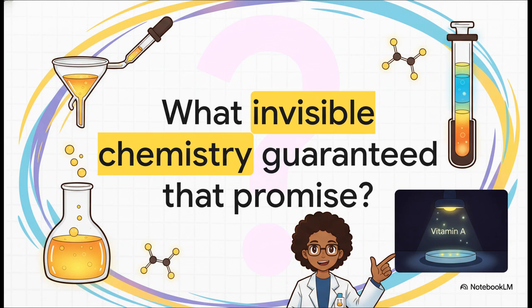Thanks for joining me, Dr. Chem, for this explainer. We've seen how saponification, selective extraction, and precise chromatography all work together to guarantee product safety. So, the next time you pick up a fortified food product or a container of infant formula, take a close look at that single quiet line on the nutrition label and ask yourself, what other invisible chemistry is protecting the food on your plate?